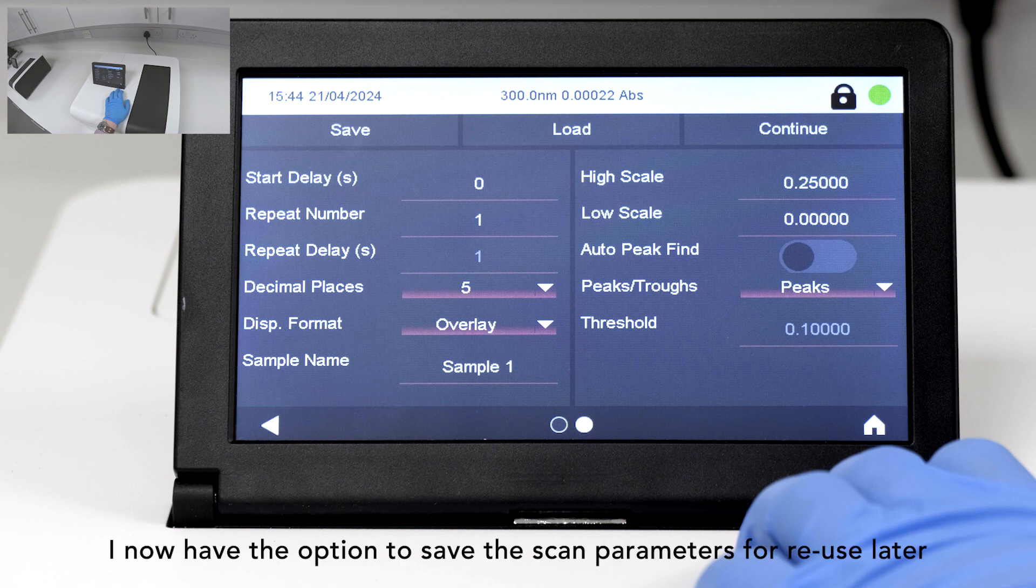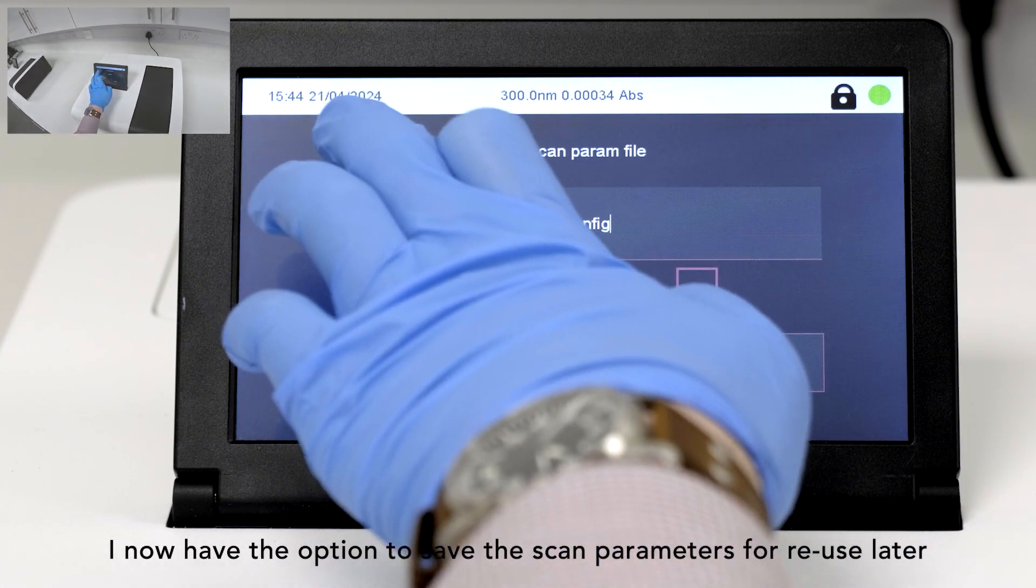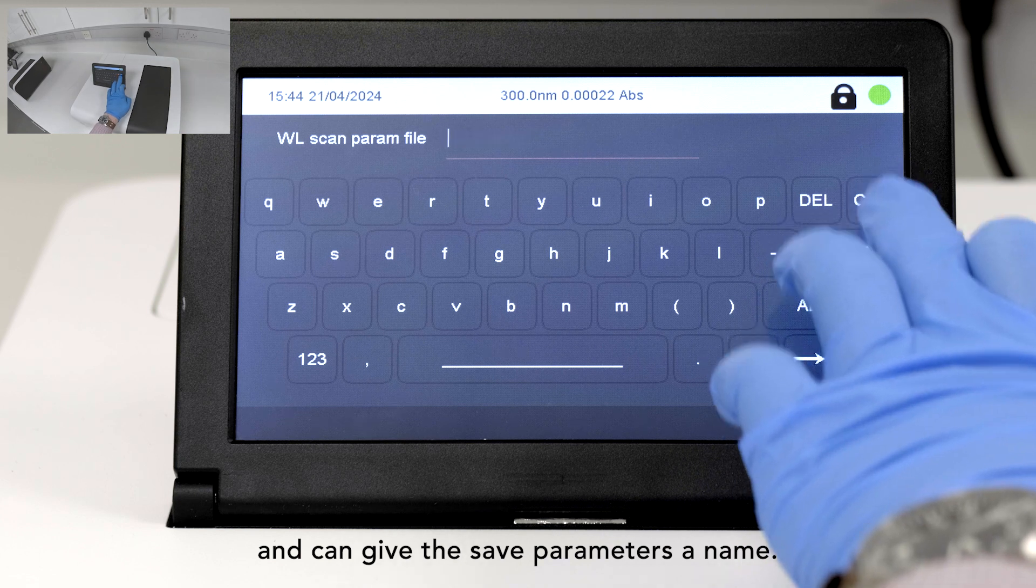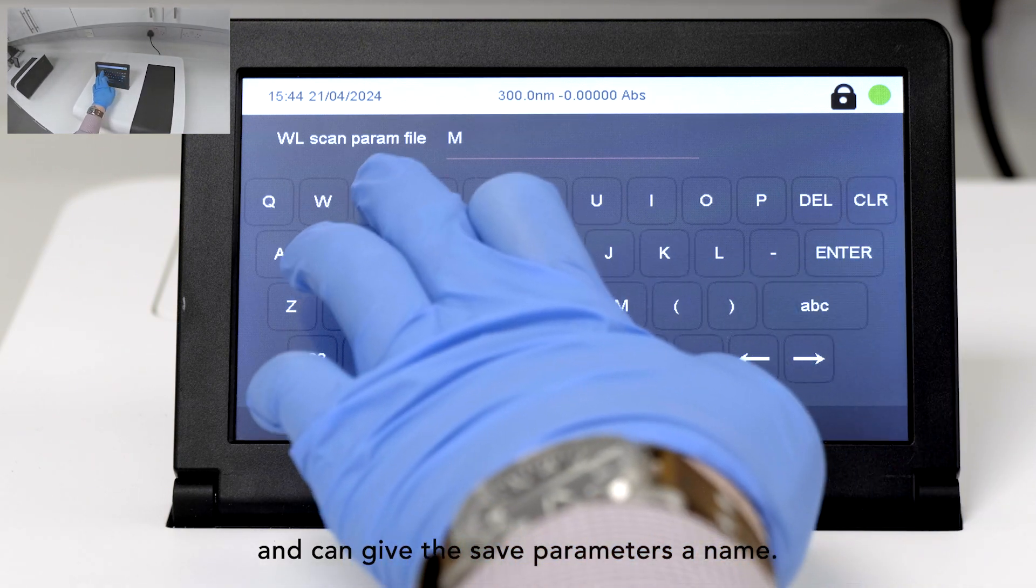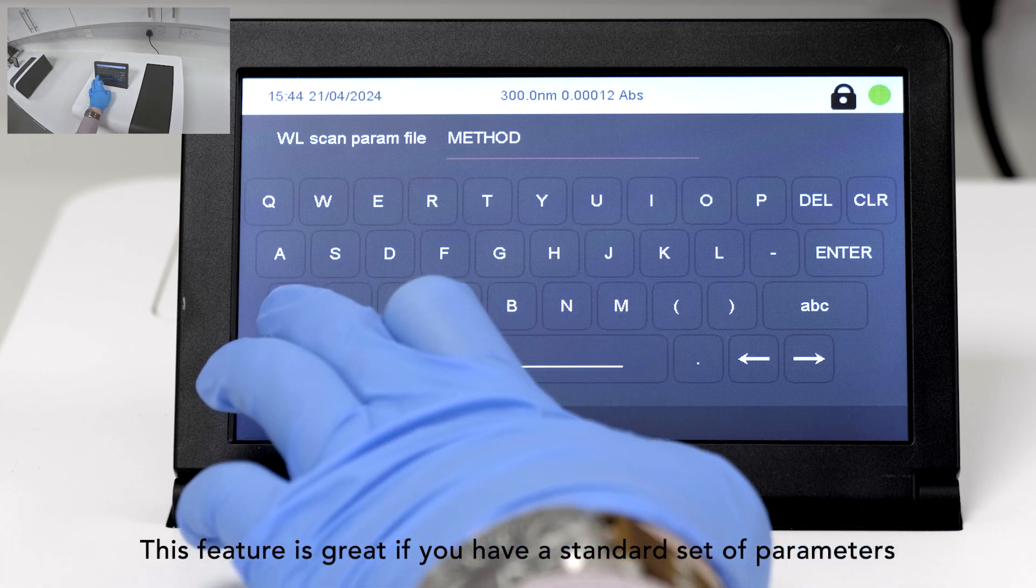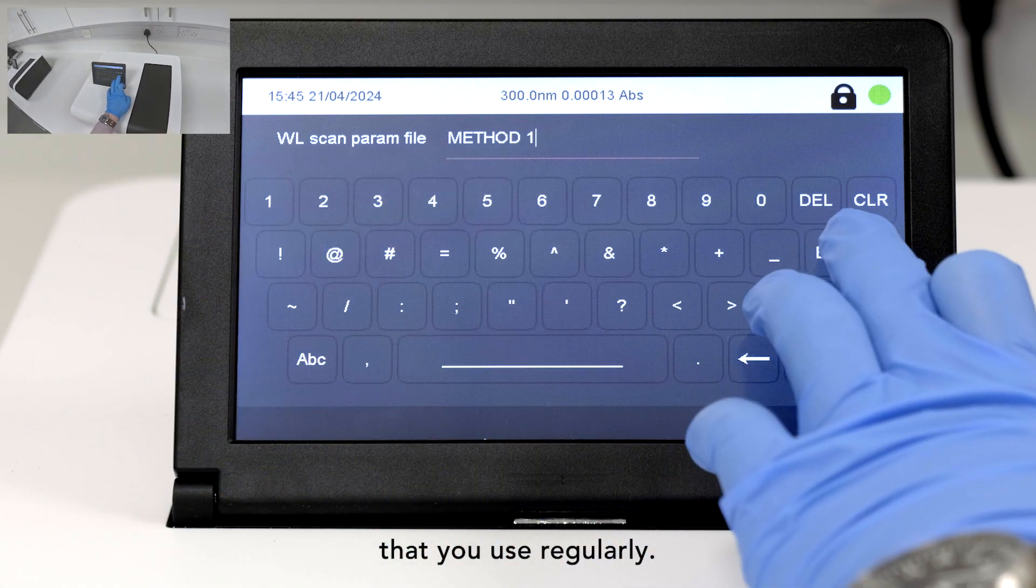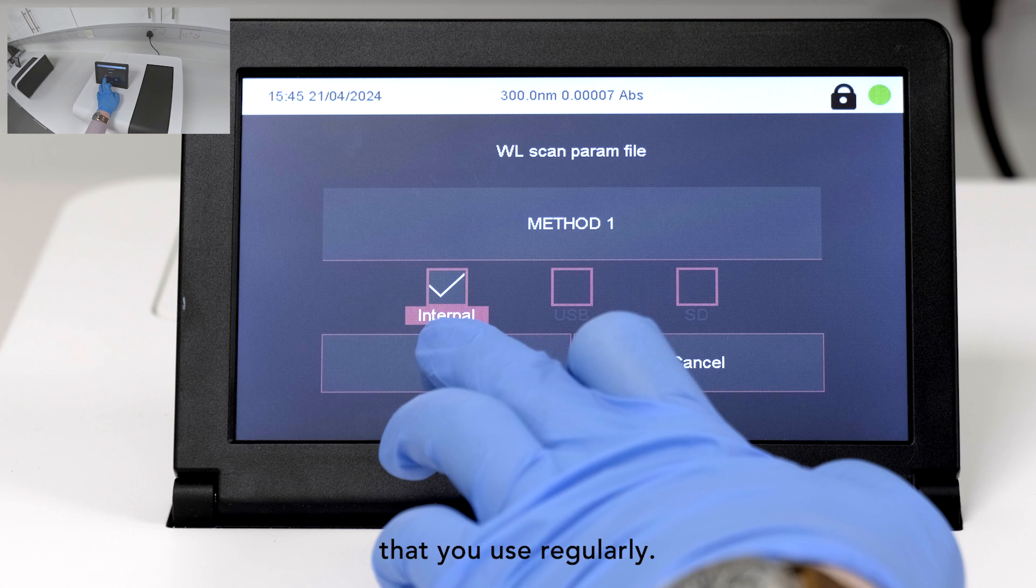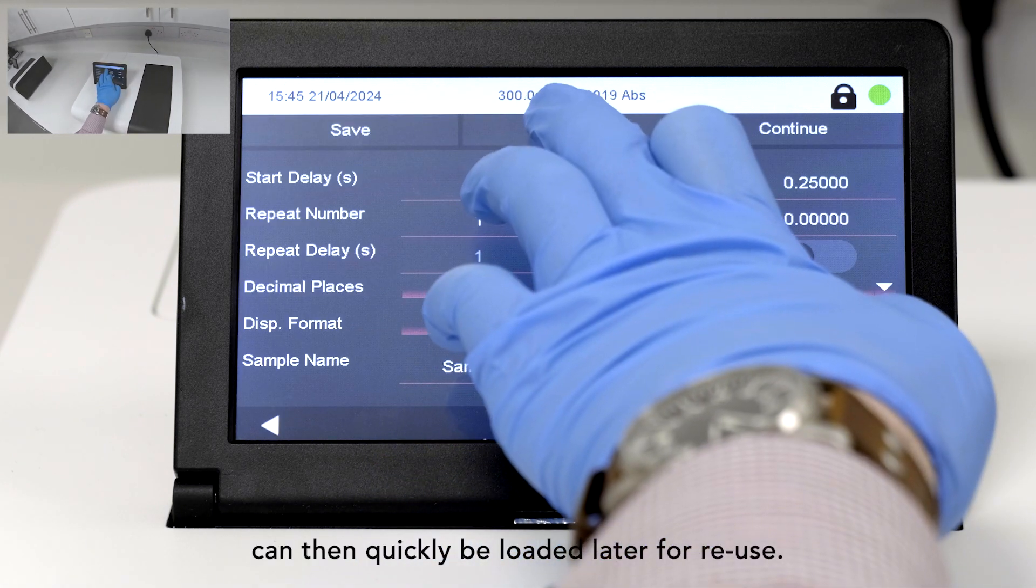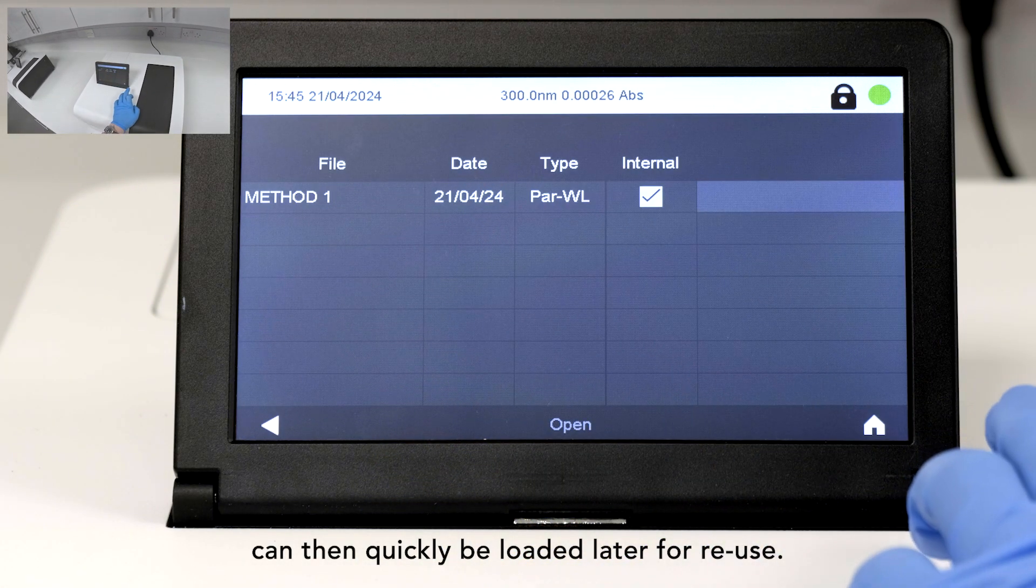I now have the option to save the scan parameters for reuse later and can give the saved parameters a name. This feature is great if you have a standard set of parameters that you use regularly. These saved parameters can then quickly be loaded later for reuse.